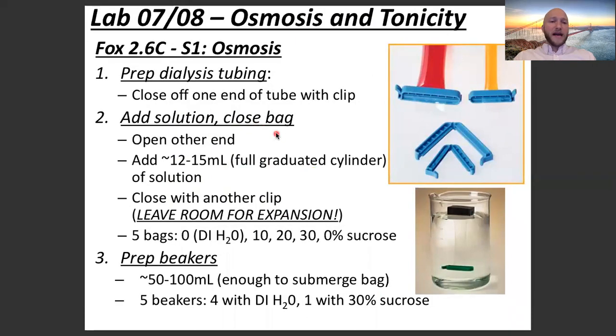In this lab, we're going to get some dialysis tubing. Dialysis tubing are these clear little packets, clear little tubes. The walls of these tubes allow water to move through, but nothing else. So salt cannot move through the walls of these tubes. Glucose cannot move through the walls of these tubes, but water can.